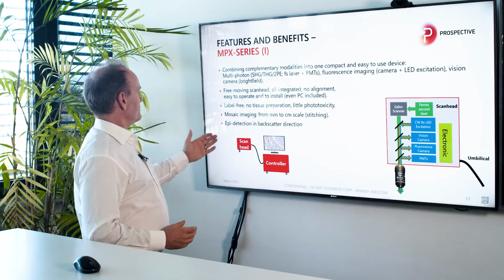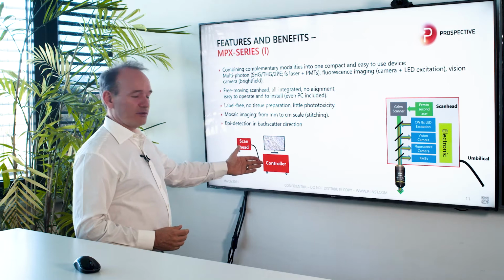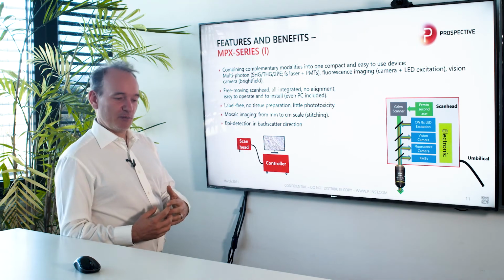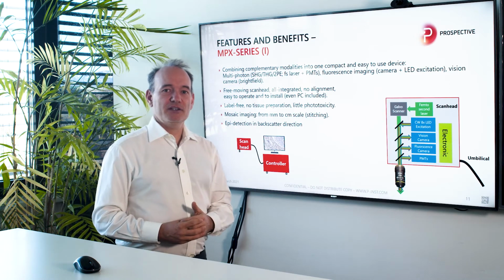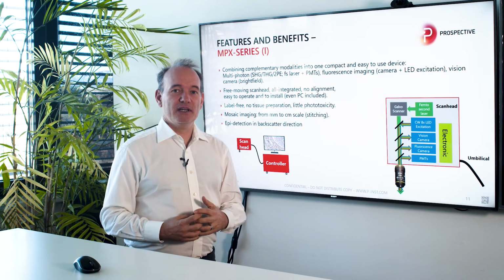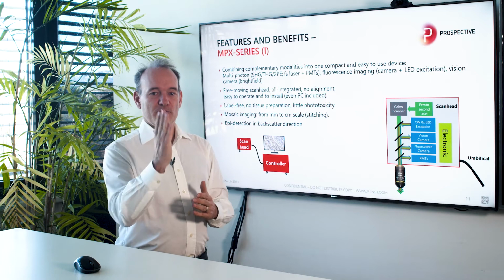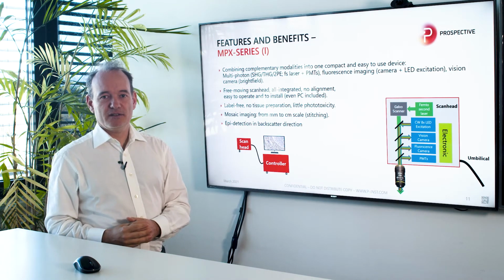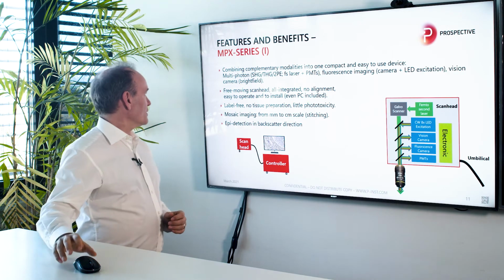The advantage is, because the scan head is connected to the controller with an umbilical, you can freely move it in 3D, actually. So if you put it on a translation stage, it moves and it will be permanently aligned. You can put it from an upright to an inverted position, and you can even scan your samples under an oblique angle.